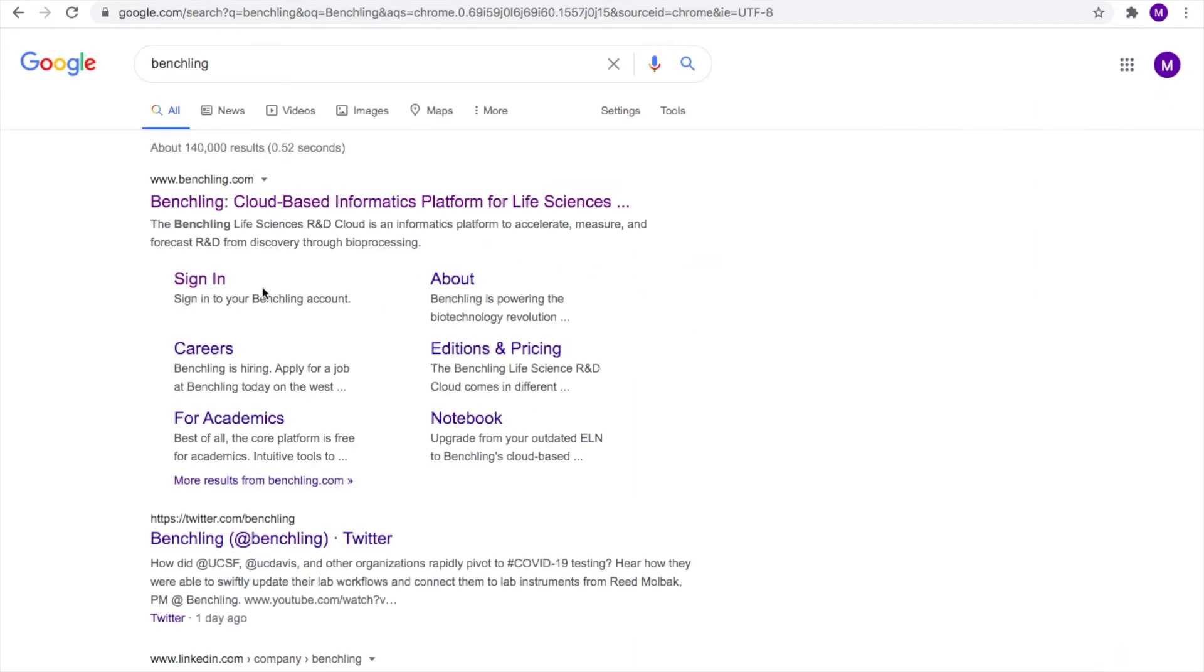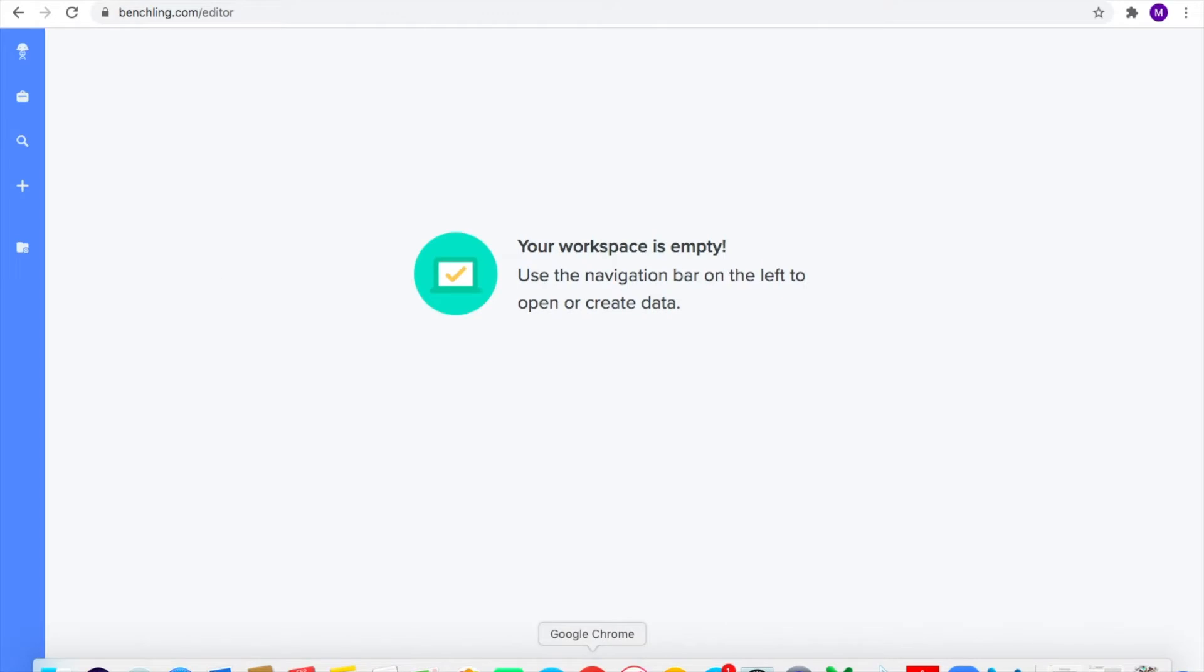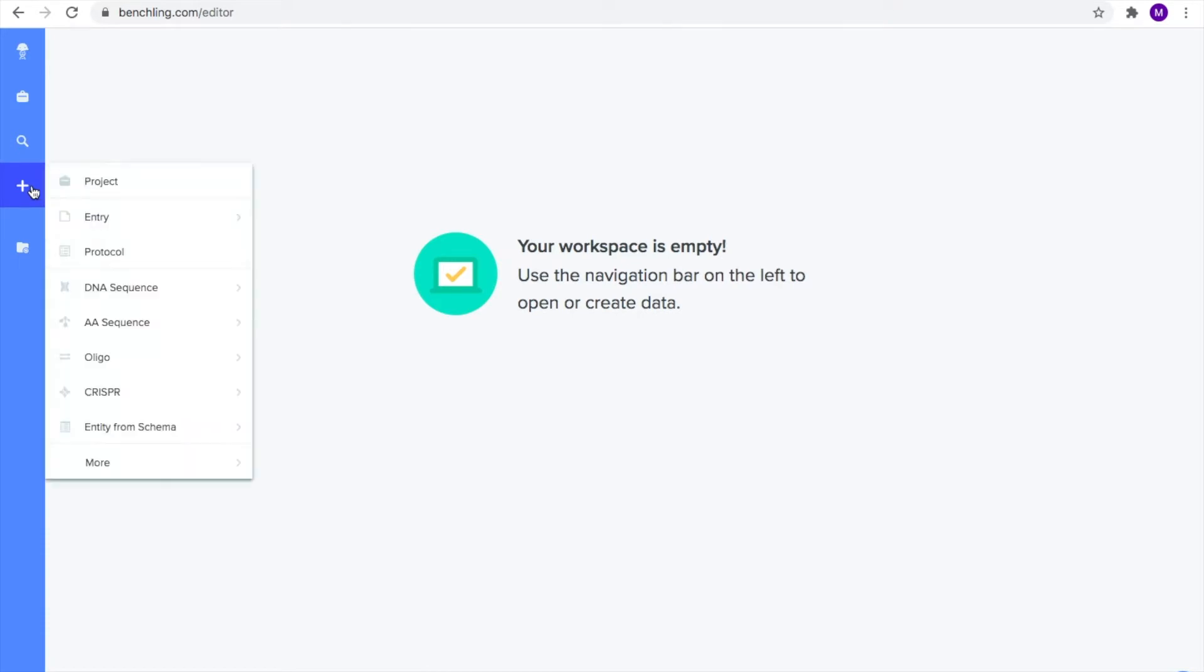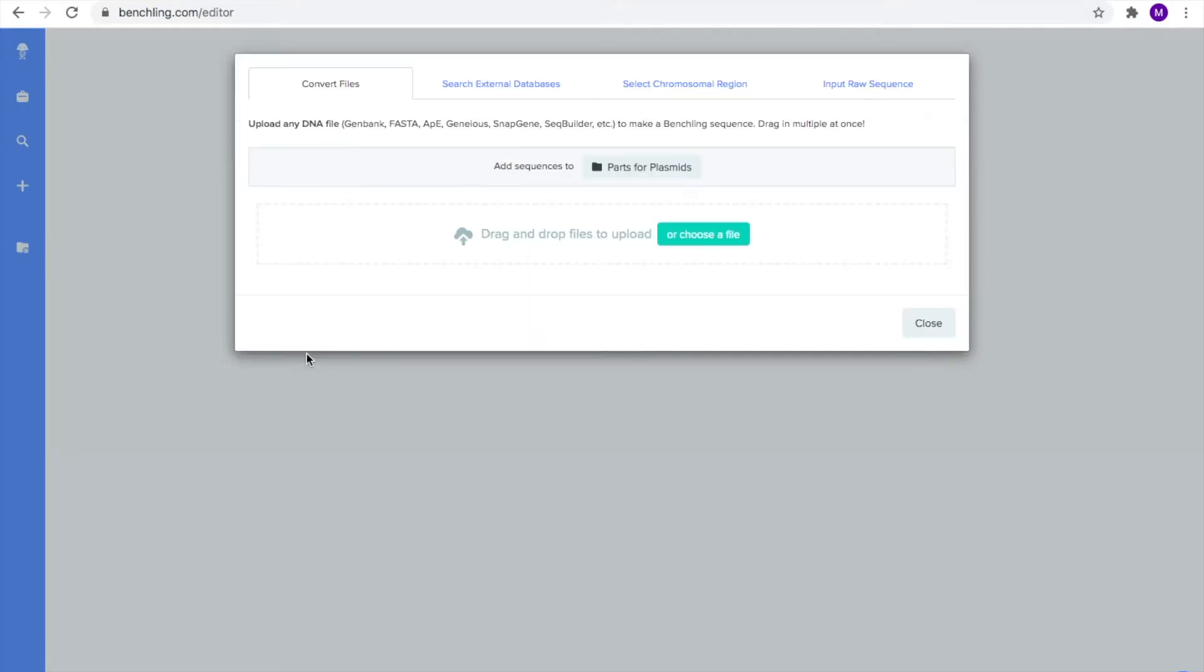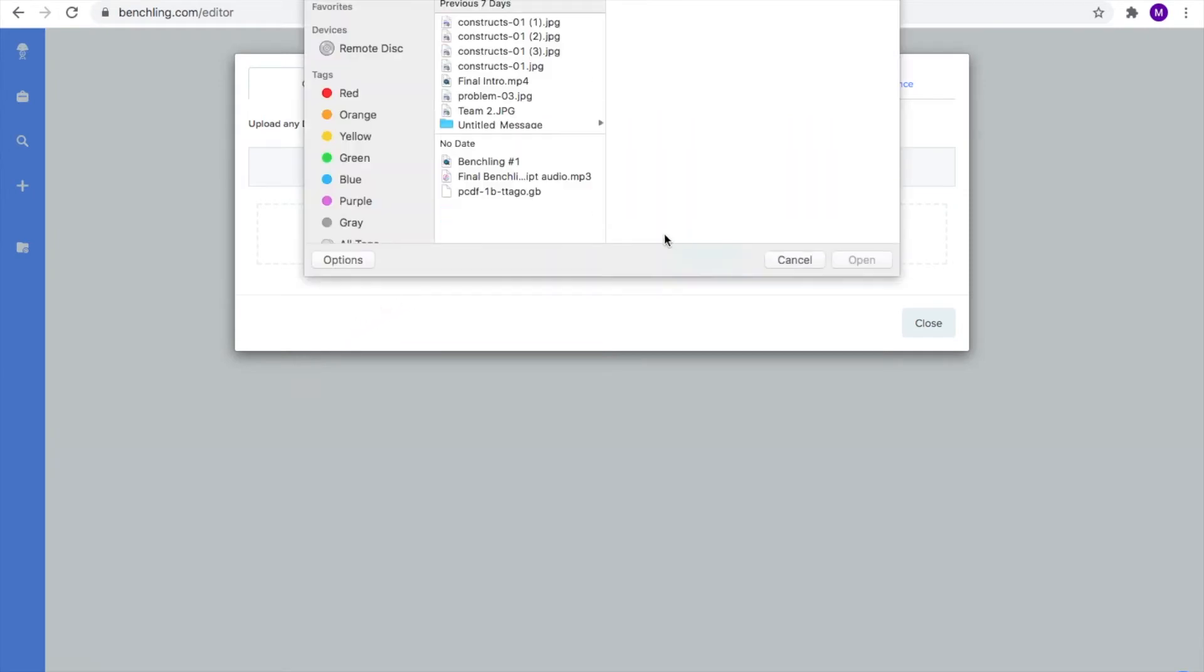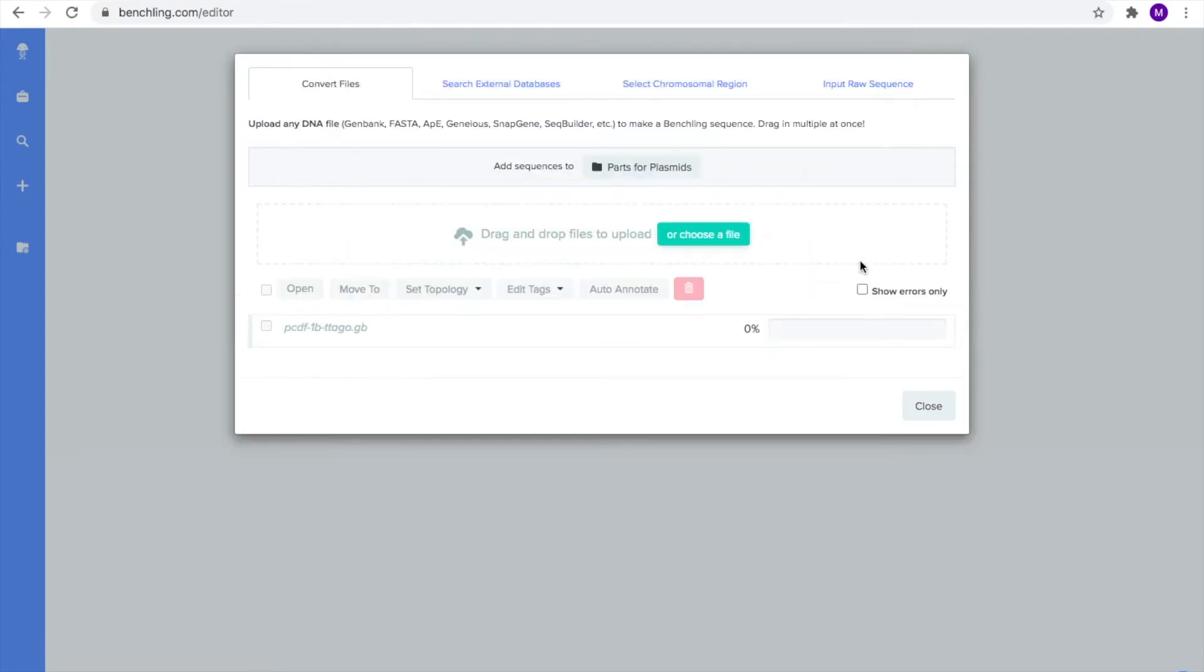To open this plasmid on Benchling, download the FASTA file linked below. After downloading it, open up Benchling and find the plus icon on the left side of the screen, which says create when your mouse hovers over it. Then select DNA sequence, and under that select import DNA sequence. Then drag and drop the downloaded FASTA file into the gray dashed box, or select the file from your hard drive.